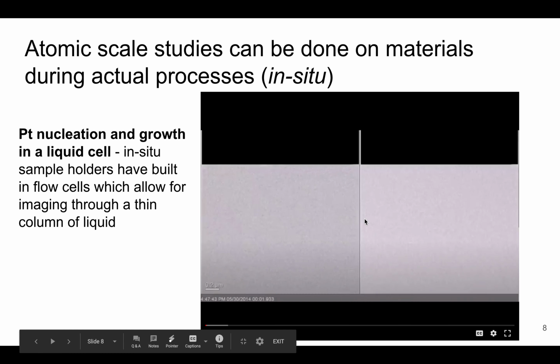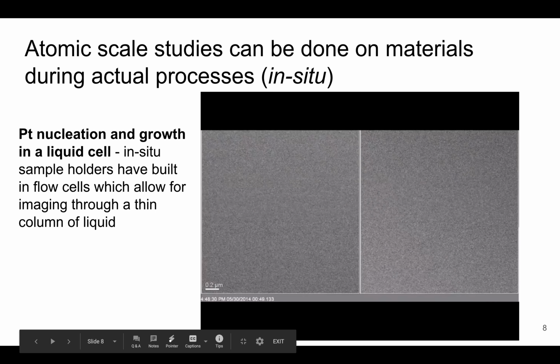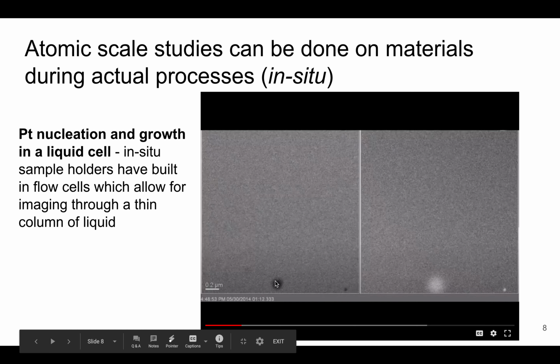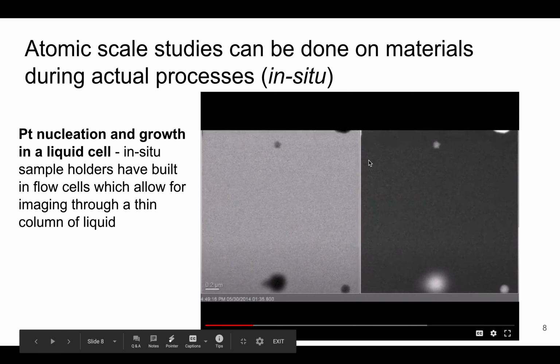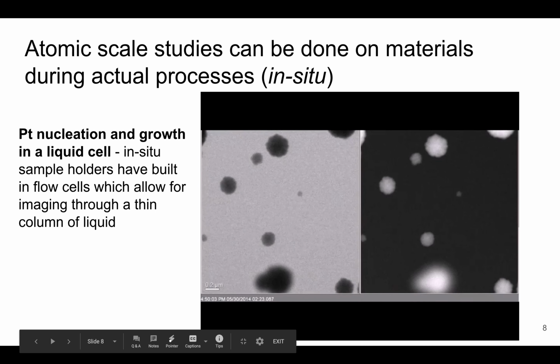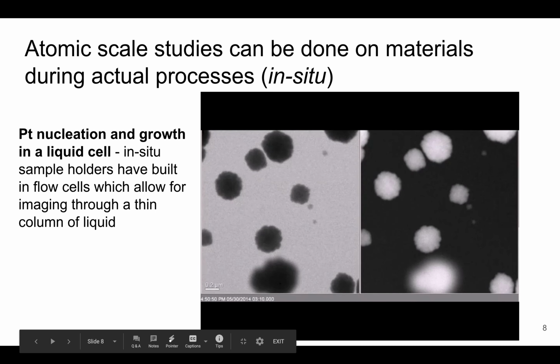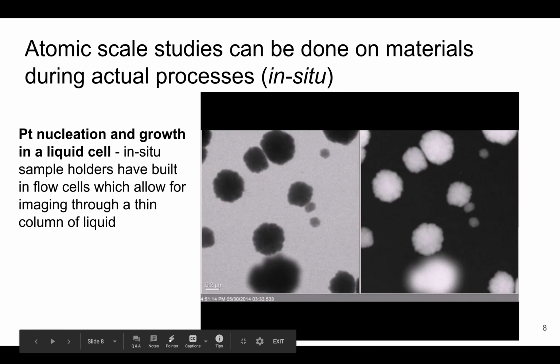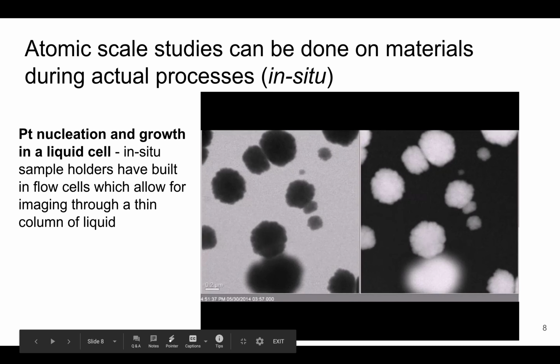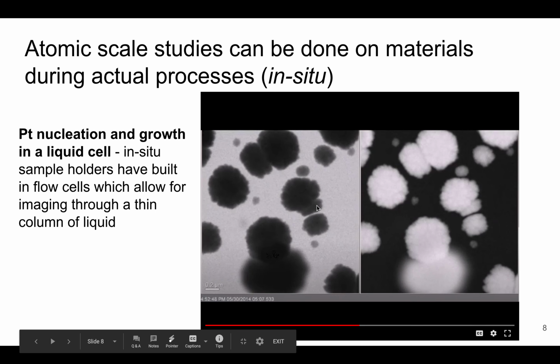If I just play you the video here, you can see particles start to form and grow, and you see more particles form, and then you see their growth and coalescence as well. So you can see all of these features, and we're looking at very thin layers of liquid. That's a pretty recent advancement, to be able to visualize through a liquid, but it's a very thin liquid that's contained within a cell. And so you can see their growth and so forth in this cell.